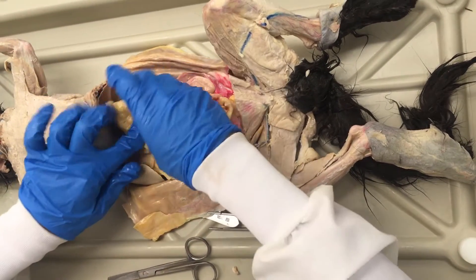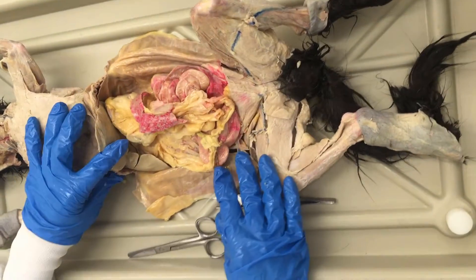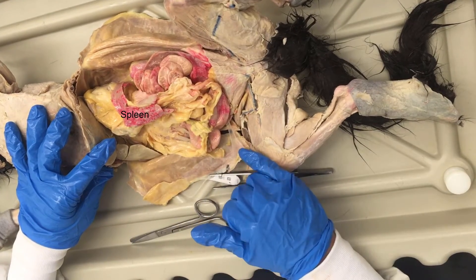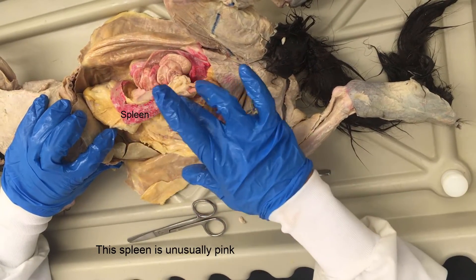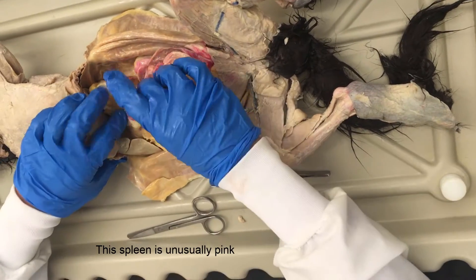Before I lift the greater omentum up, I want to point out this structure here. This is the spleen. The spleen is a bit pink — it looks like the injection went onto the surface of the spleen. Not every spleen will look like this; sometimes they'll just be plain gray.